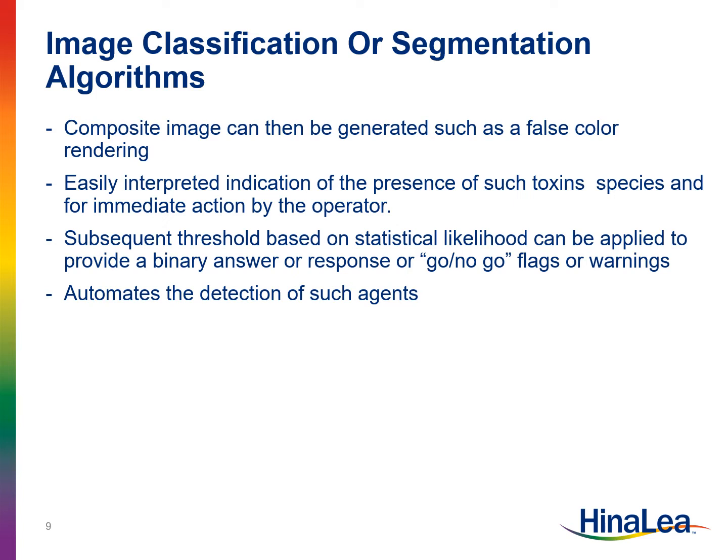This then can be easily interpreted to determine the presence of toxins and enable the operator to take immediate action. You could then also apply statistical methods to that data to provide a binary answer, response, go, no-go flags, or warnings, thus automating this inspection.